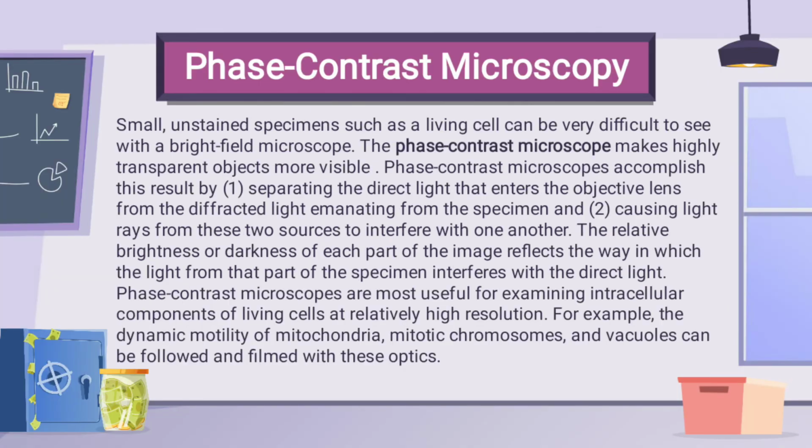Now let us proceed with phase contrast microscopy. Phase contrast microscopy was first described by the Dutchman Frits Zernike in 1934. This technique is ideal for thin, unstained specimens which are approximately 5 micrometers thick above the nucleus but less than a micrometer thick at the periphery.